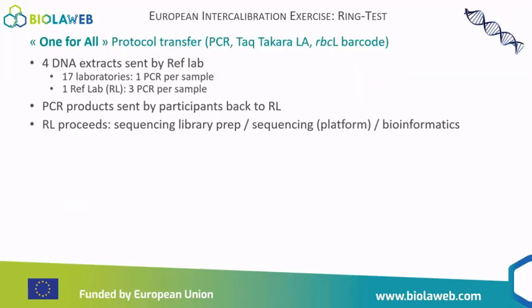So we had 2 kinds of approaches. One was the one-for-all, that means one protocol that may be transferred to different labs. So one protocol for all labs. And I will present you here the results for the PCR.